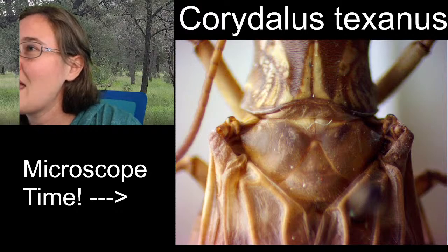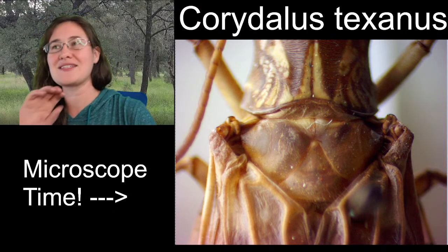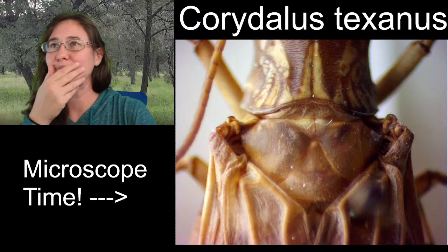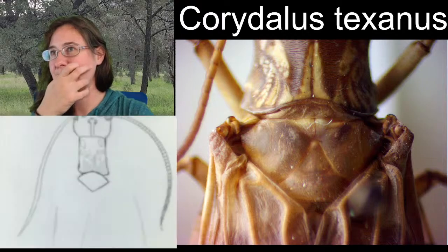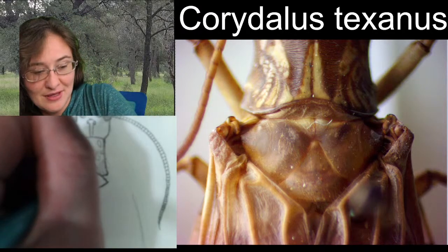Okay. And we know that the right wing is going to be going over top. I like that X in the center of its scutellum-like segment. I like this.